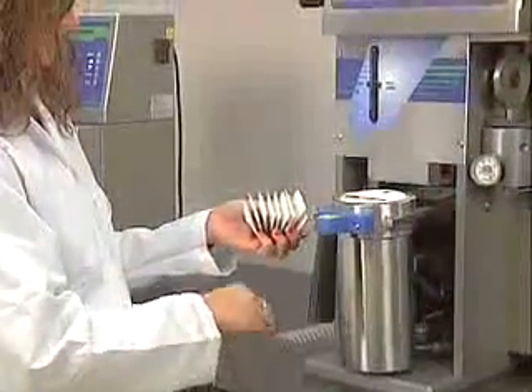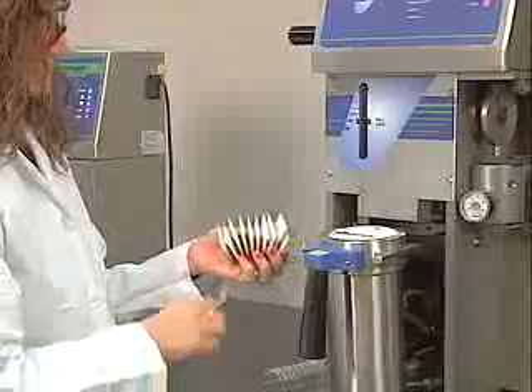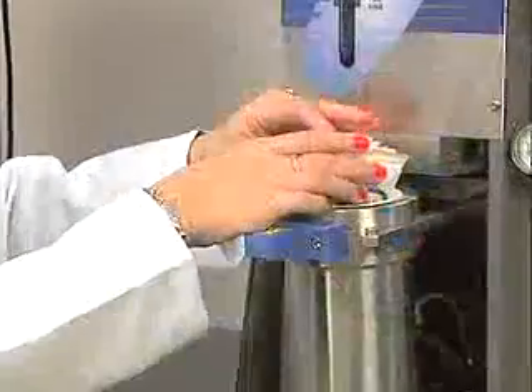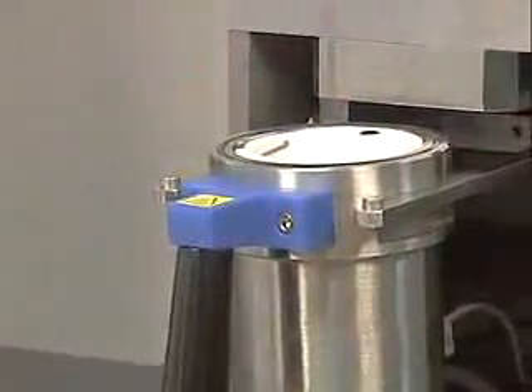Up to 15 samples can be placed into the XT15 sample insert. There is no time-consuming or complicated setup of heating plates and glassware. Simply place the loaded sample insert into the extraction vessel and you're ready to begin.